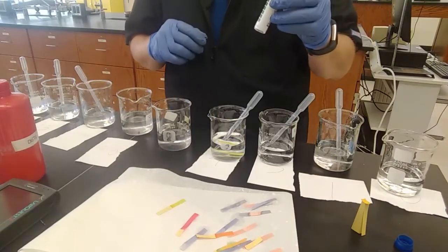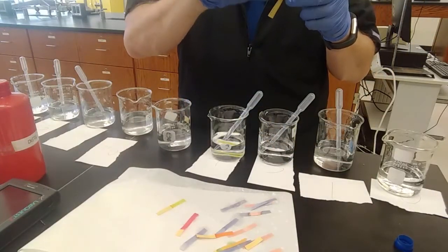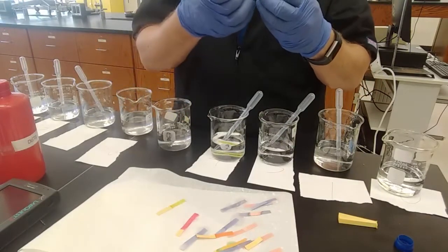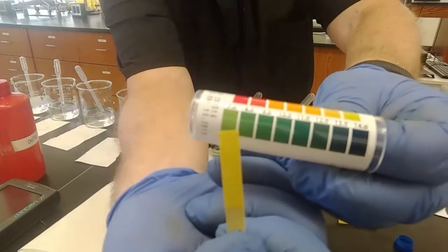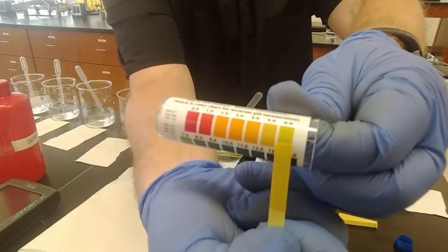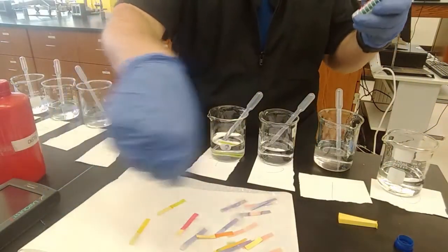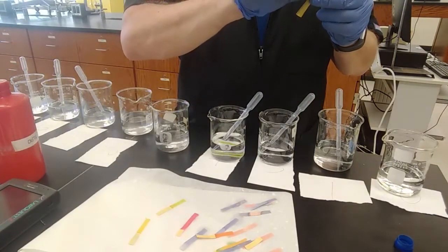Oops. Helps if you don't drop it into the 4. We can leave that there. Not going to change the solution. 7. Expecting a green for a 7. It's not. It looks pretty much the same as the last one did, a 5. This pea green, expecting a 7, it's a 5. The meter said it was even more acidic than that. It's definitely not 7 though.